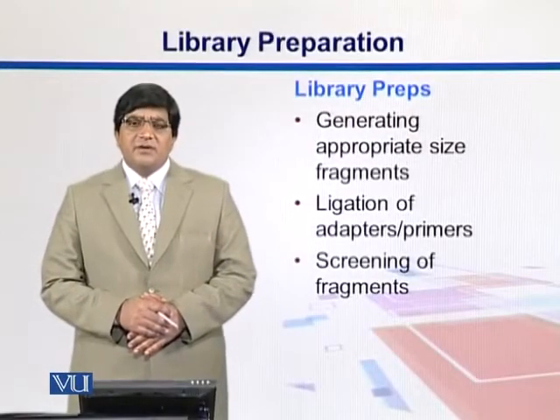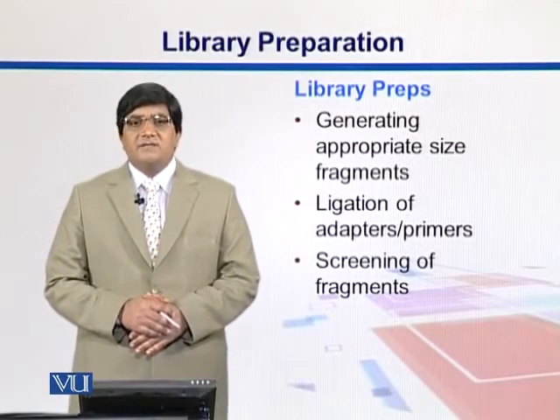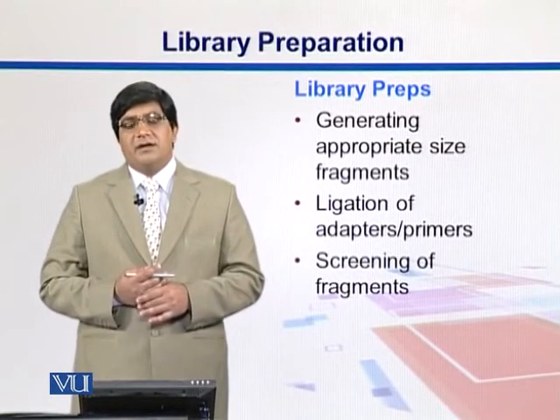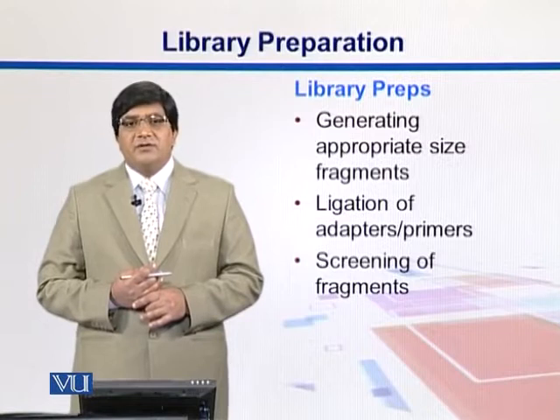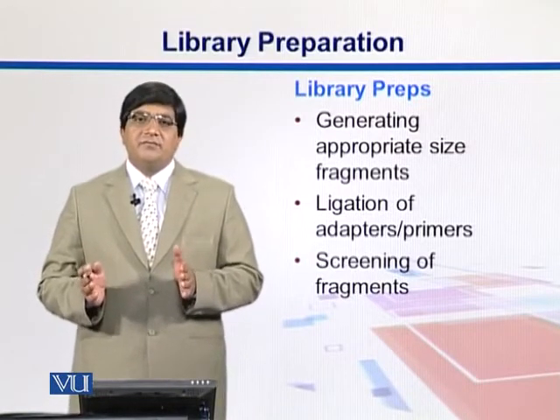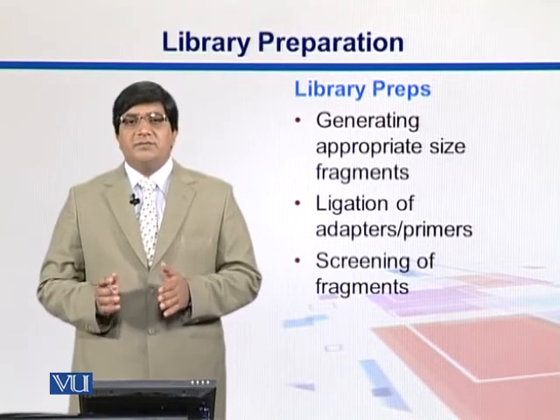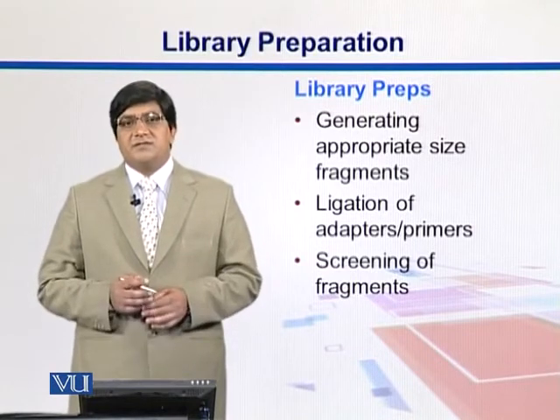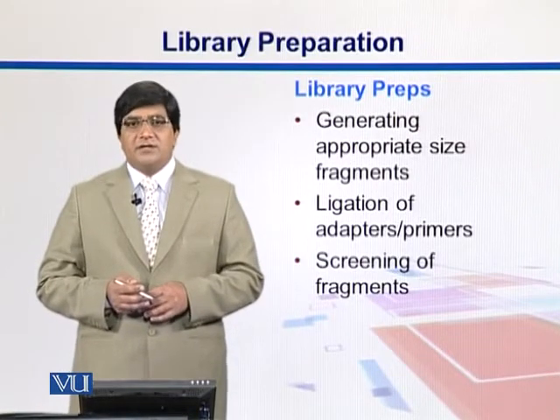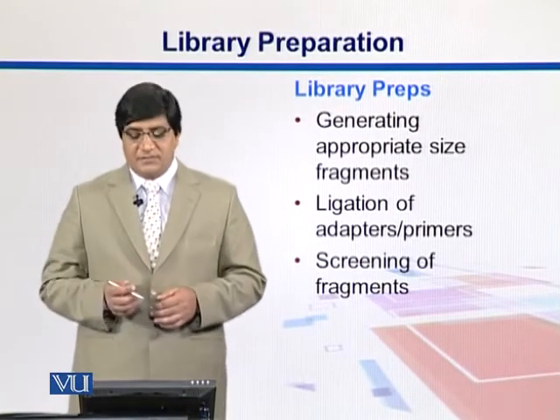So in library preparation, we have already extracted RNA or DNA, and what we do next is fragment that, and then prepare it to be placed into the sequencers for sequencing. All the steps before putting it into the sequencer, we can call library preparation.